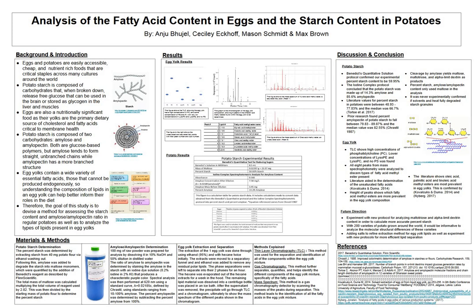And then as far as the amylose to amylopectin ratio, we took more of the raw flour, and after washing it out, we used an iodine dye solution, so it was 0.2% iodine and 2% potassium iodide. That produces a characteristic purple color upon binding to the amylose. And then we did spectral analysis at 620 nanometers with a standard curve of 0.02185 times concentration equaling absorbance that was derived from the literature, using standards ranging from 10 to 100% amylose. And the percent amylopectin, on the other hand, was determined by subtracting that percent amylose we found from 100.